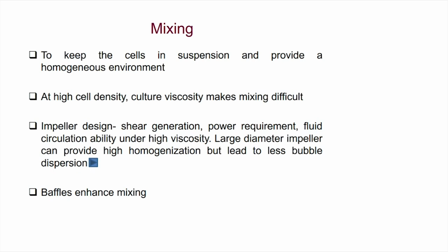So therefore helical ribbon or centrifugal impellers are specific impeller designs which are frequently used for plant cell fermentations, because they can create both axial and radial movements and better KLA in comparison to impellers like radial impellers used for microbial fermentations, and less shear forces on the cells.